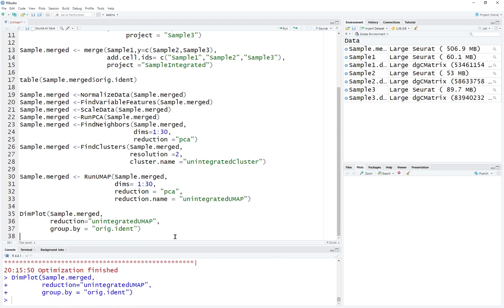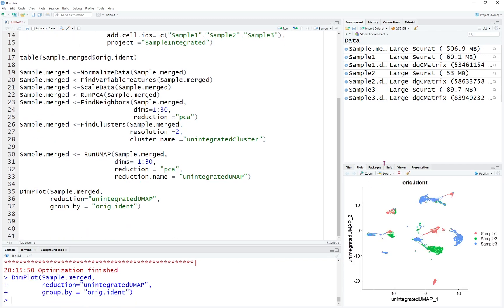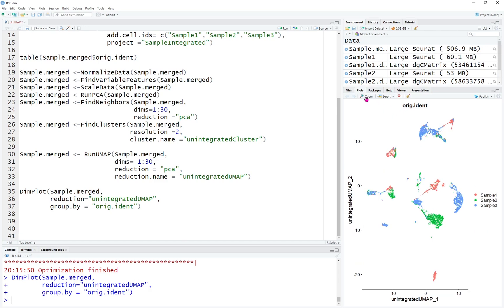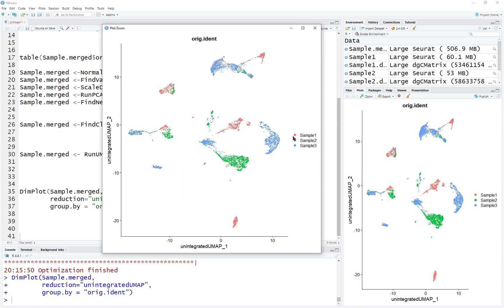Let's plot this out. Click Zoom for a much larger image to show the results. You can see the data is kind of distributed everywhere, and for some clusters, sample 1, 2, and 3 are different from each other — they're not really merged. This is possibly caused by batch effect, because the data was collected from different patients, causing systematic errors due to technique or sequencing issues.